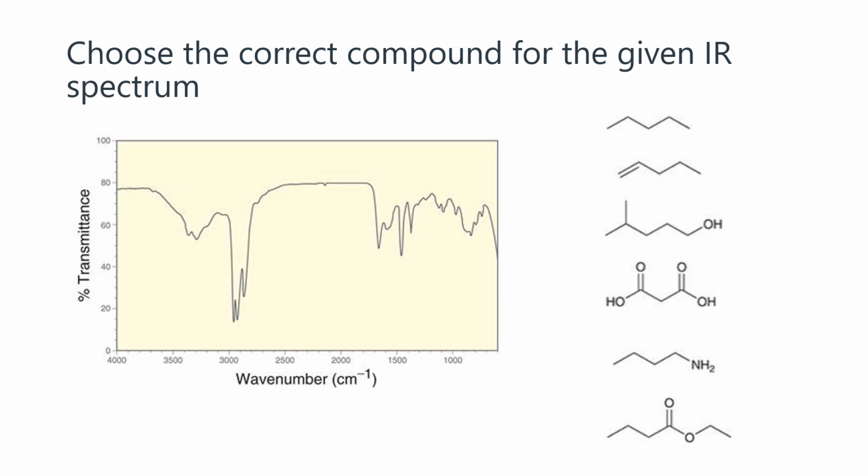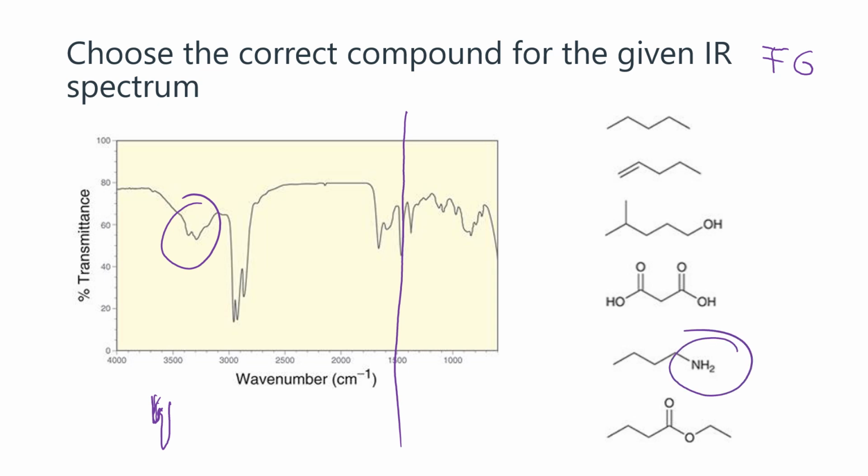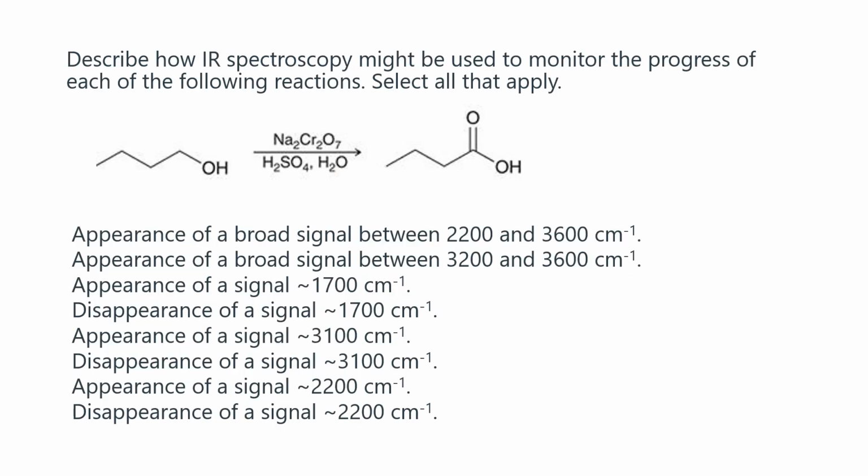Okay, what is interesting to see here? Again, you're looking for functional groups when you're looking at a spectrum, and that is about the 1500. In here, I have the shape. So it's not as evident, but typically that is a primary amine. It always looks like this, two peaks. So that is your answer right there. We don't have a carbonyl. And all of the other peaks here are due to carbon sp3 Hs.